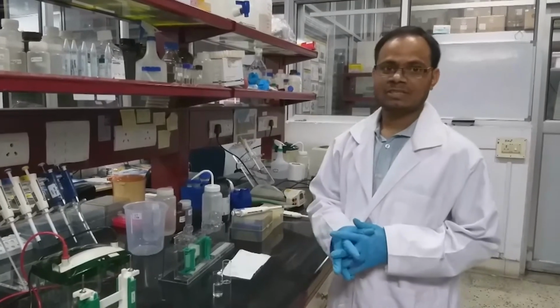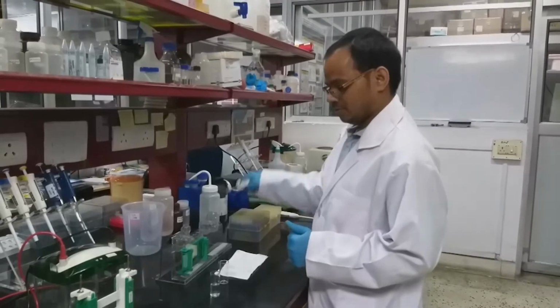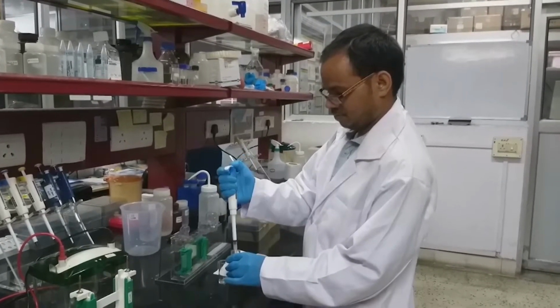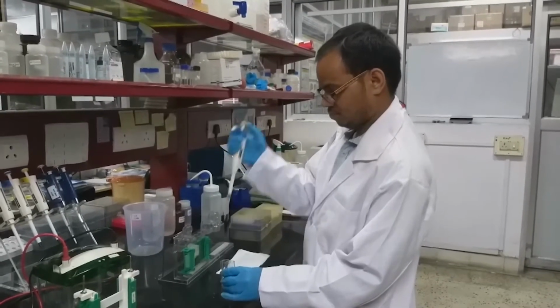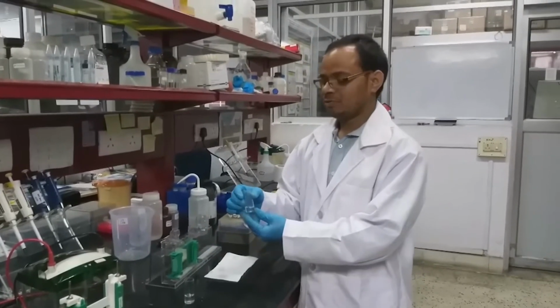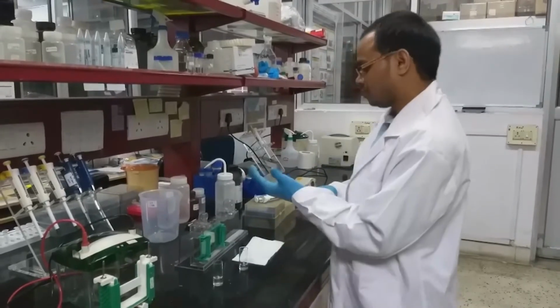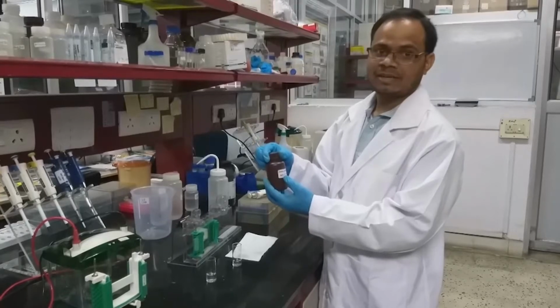So the composition is given in this slide. Please go through that slide. This is just water. First I used water. I am going to add sequentially 4 ml of water. Now I have to add 3.3 ml of already prepared 30% acrylamide.